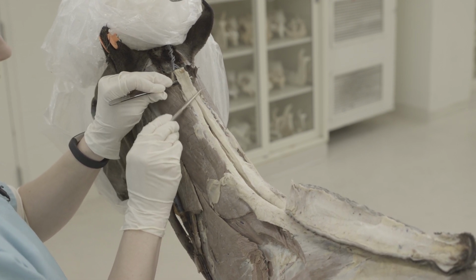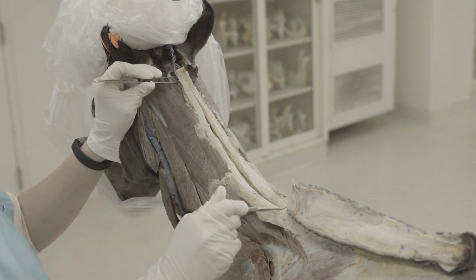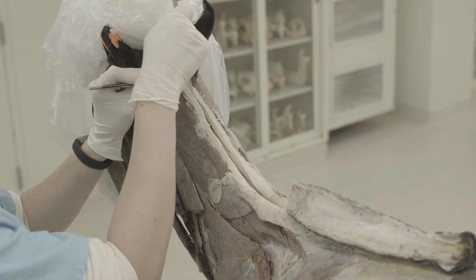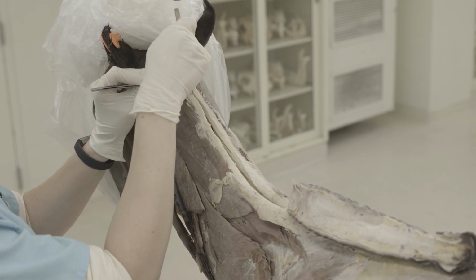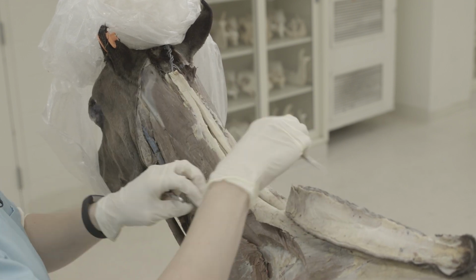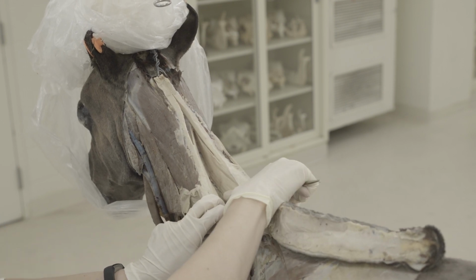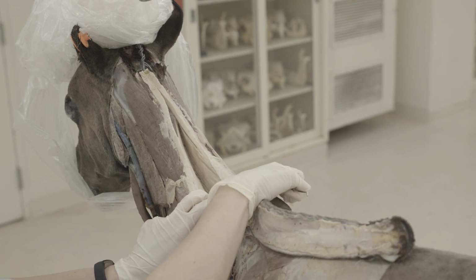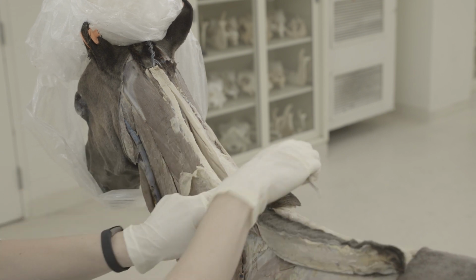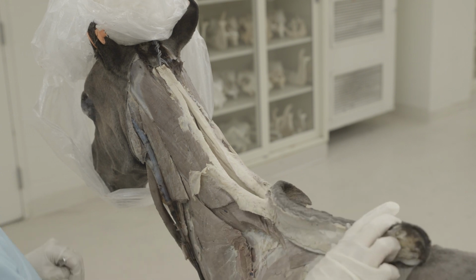So the part right on the top here is going to be the funicular part. And then you want to try and find the midline, so in between the two sides of that funicular part, so you have a left and a right side, and there'll be kind of a seam in the middle, and you want to try and find that, and then work in between those two sides. And then you'll have to look down inside, and you can see the laminar part. So that's this part that extends down inside the neck toward the midline there. So laminar down inside, funicular running across the top here. So both of those are parts of the nuchal ligament.